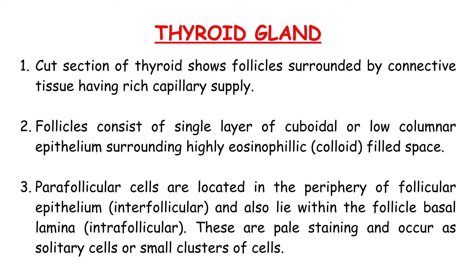Parafollicular cells are located in the periphery of the follicular epithelium, known as interfollicular, and also lie within the follicle basal lamina, known as intrafollicular. These cells are pale staining and occur as solitary cells or small clusters of cells.